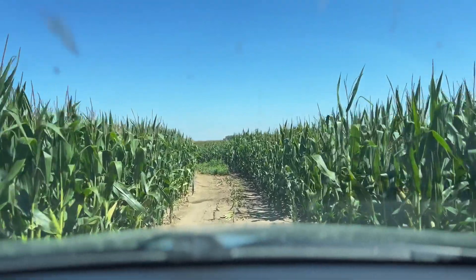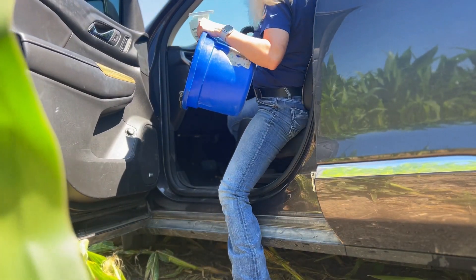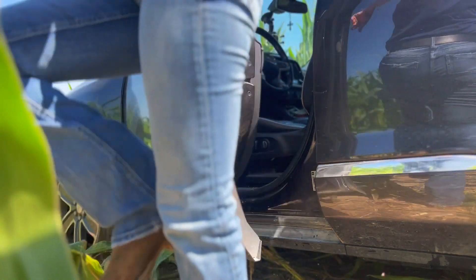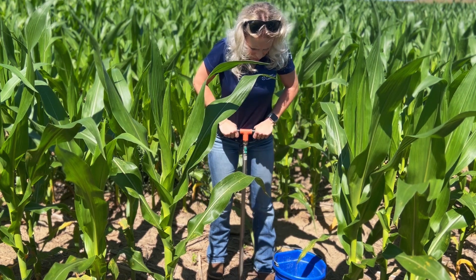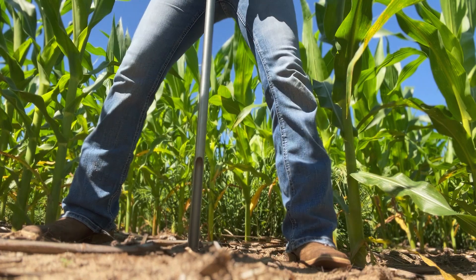At Midwest Labs, we encourage you to send in your fall soil samples. To start off, our farmer Ashley Babel is going to go out in her field and take a soil sample. She'll need a clean bucket, soil probe or shovel, and some sort of soil bag, whether it's a Midwest Labs or a Ziploc bag.